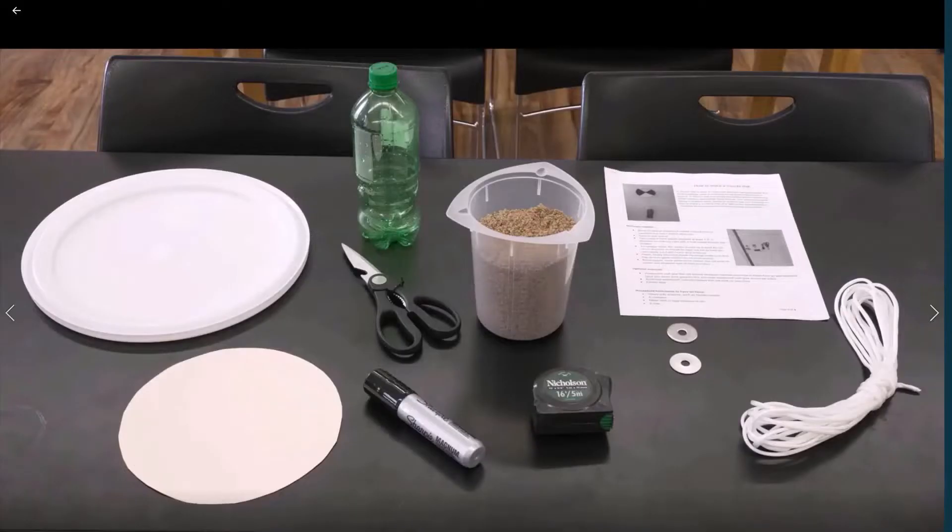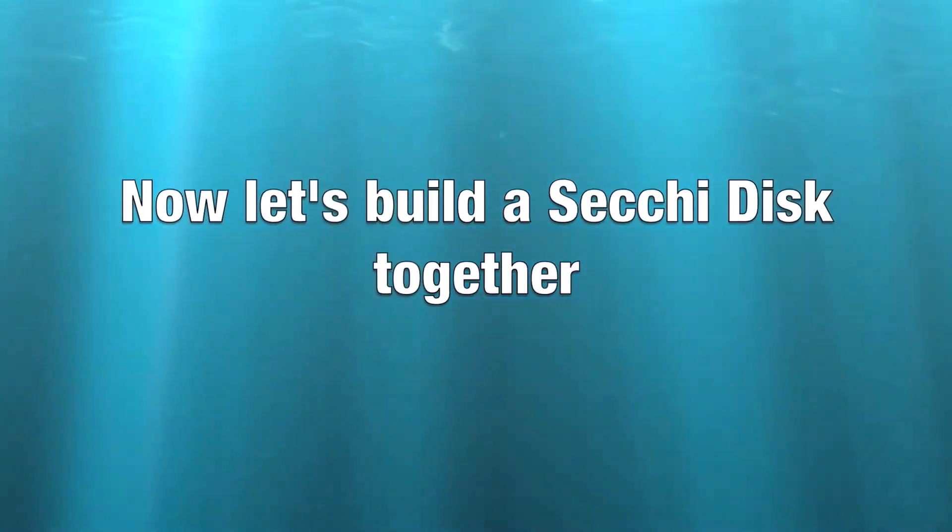What you will see us using to build the SecuDisc in this video includes: some white paracord, playground sand, two metal washers about one and a quarter inches in diameter, a white 5-gallon bucket lid, an empty 20-ounce beverage bottle, and a black Sharpie Magnum. Now let's build a SecuDisc together!